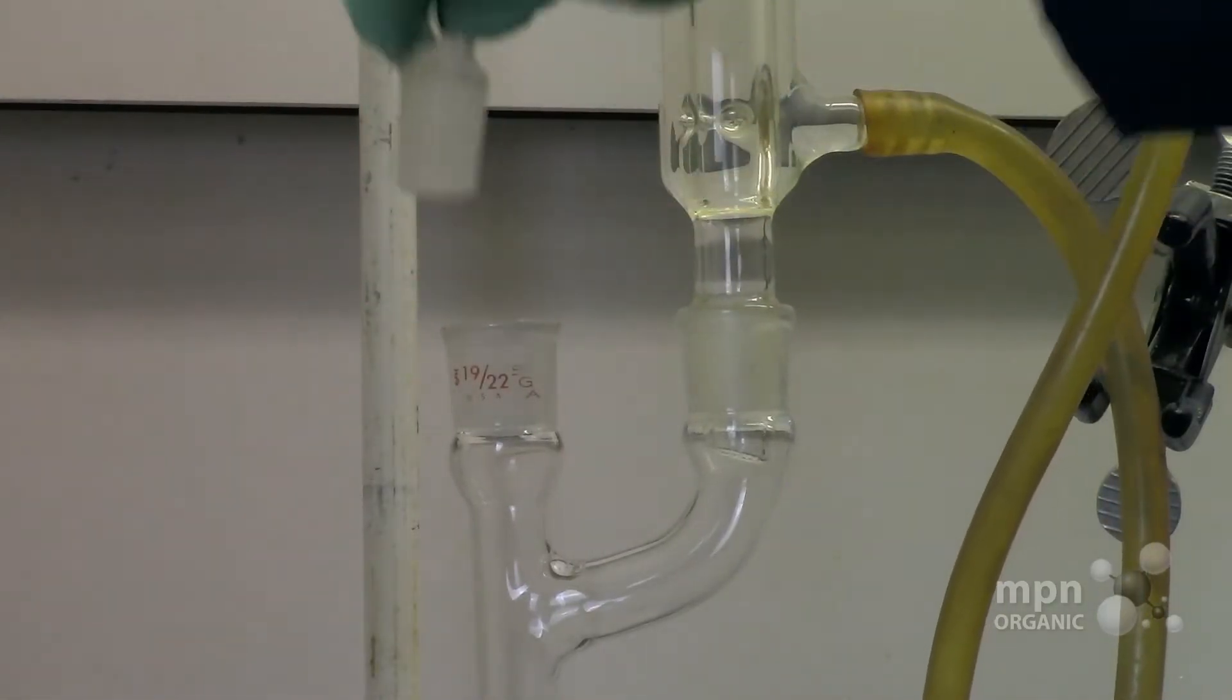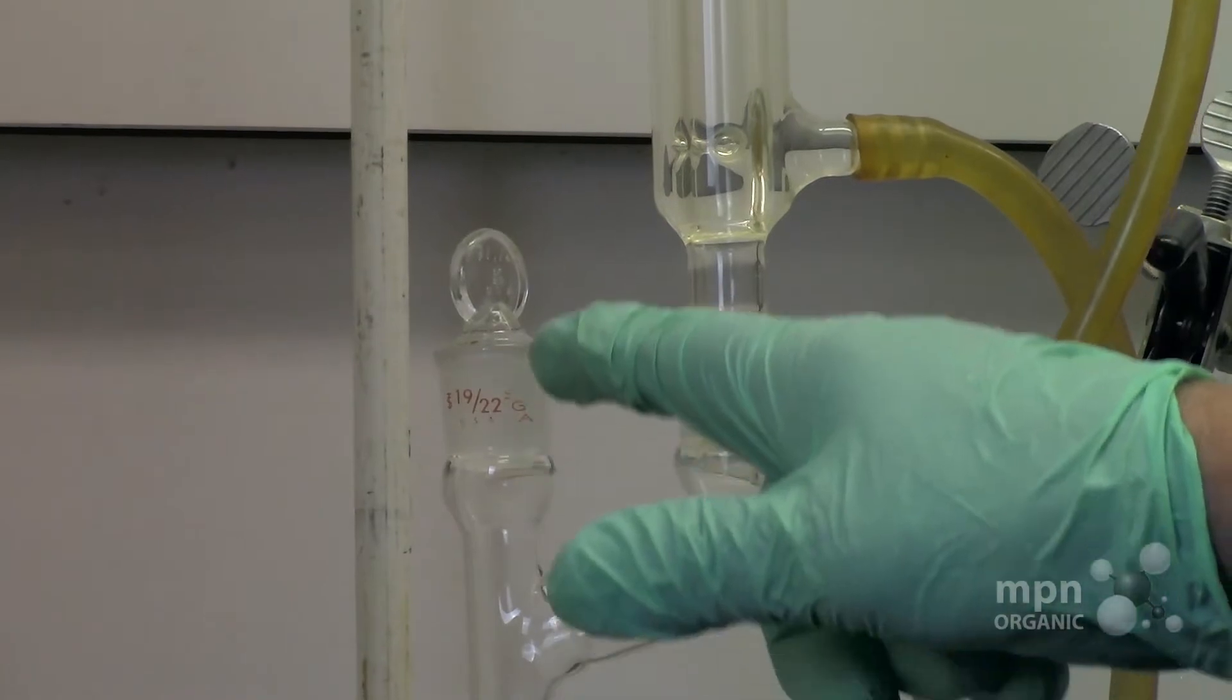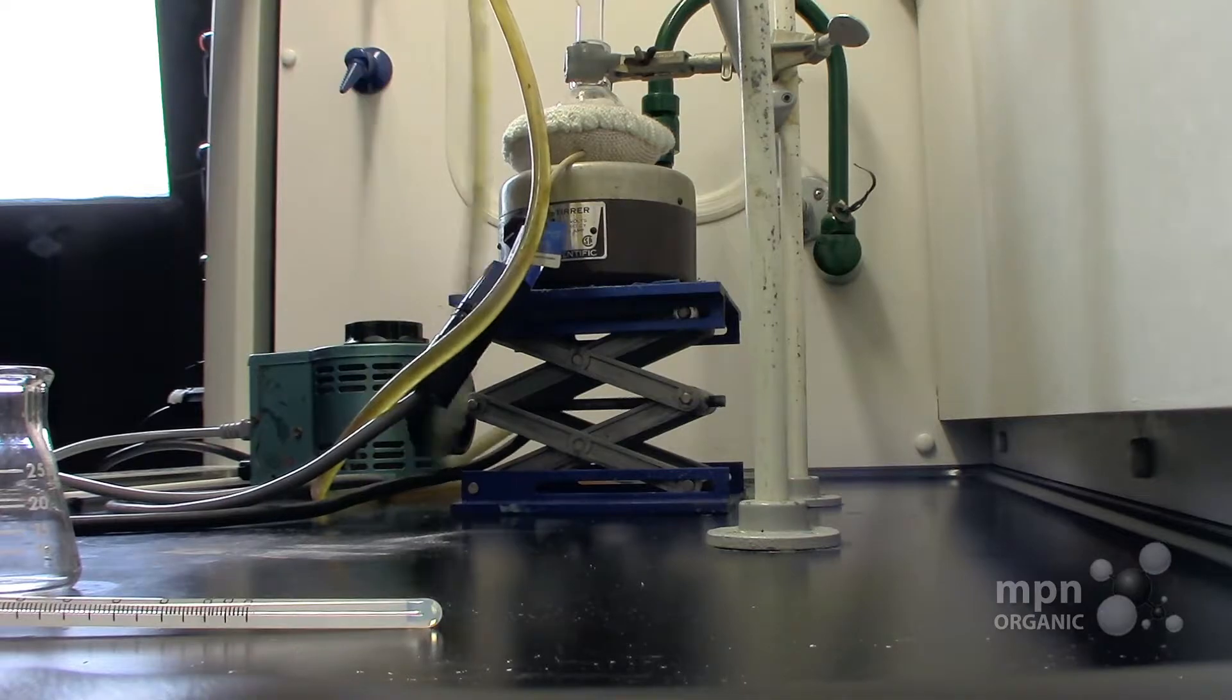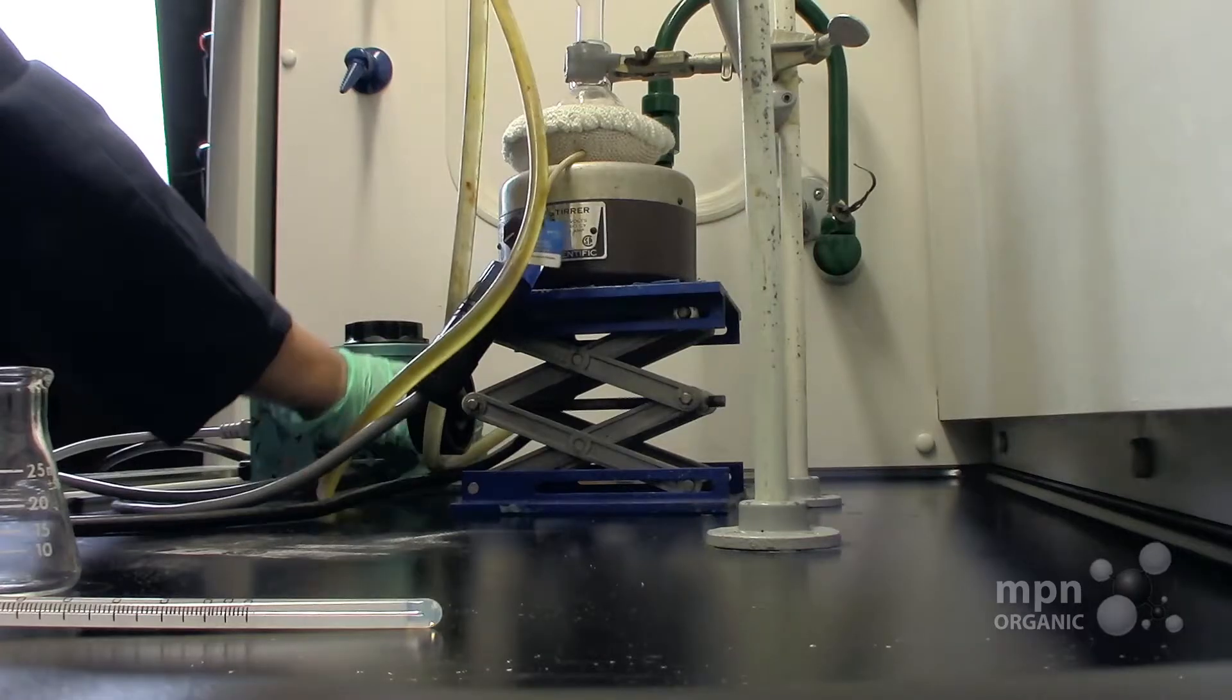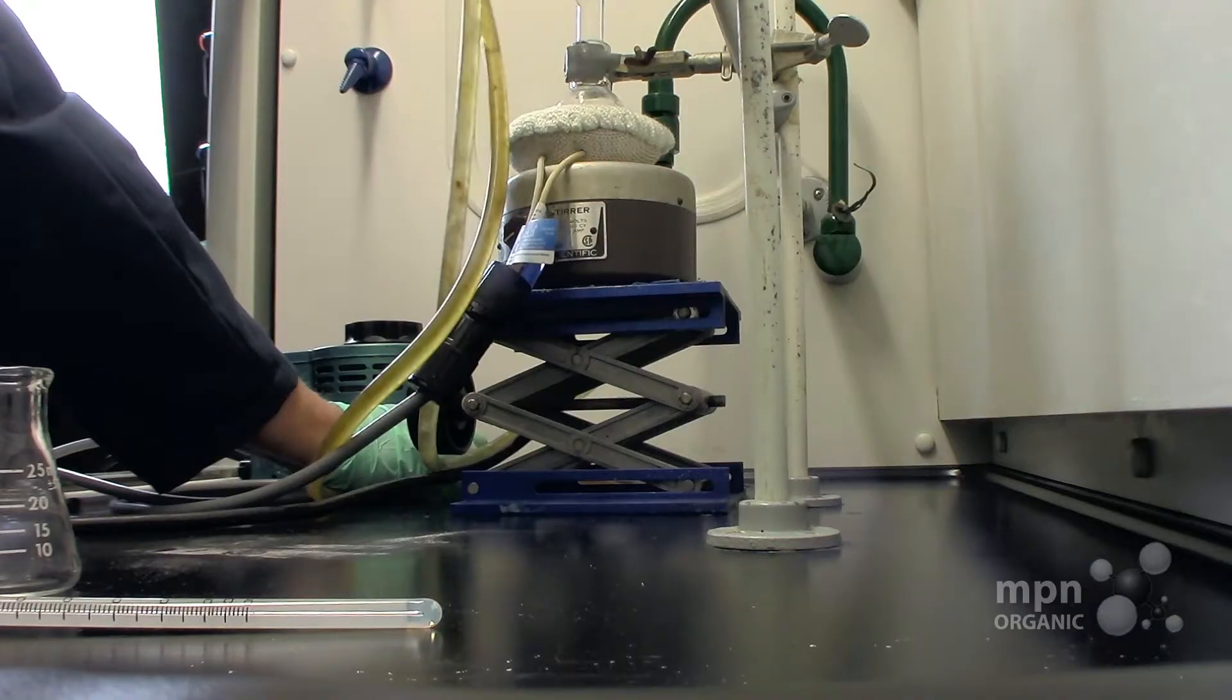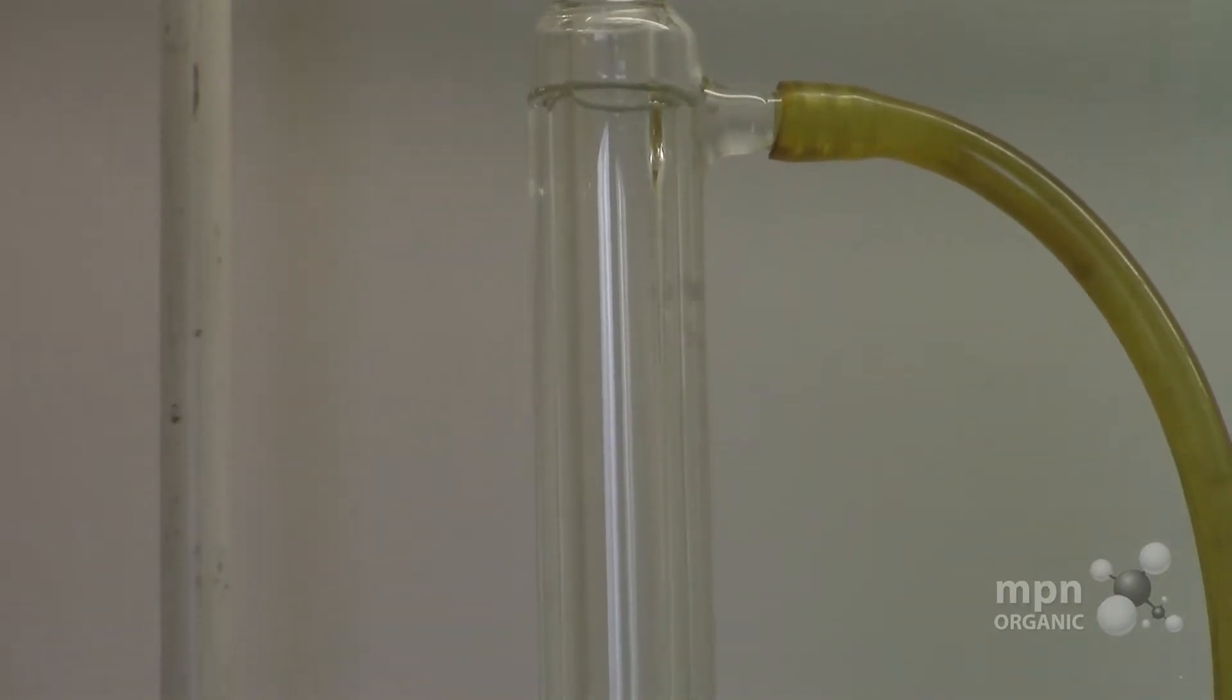Now notice that I have this thing stoppered here so that anything that volatilizes up here doesn't go out this way. The water is still entering in at the bottom and exiting from the top. Let's start that here. Doesn't have to go fast. Okay, it's going pretty steady now.